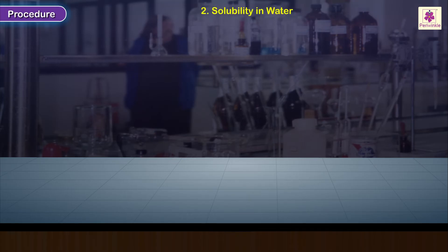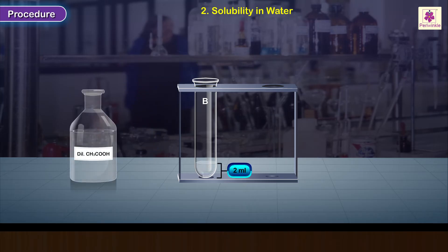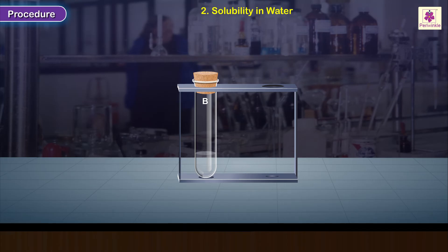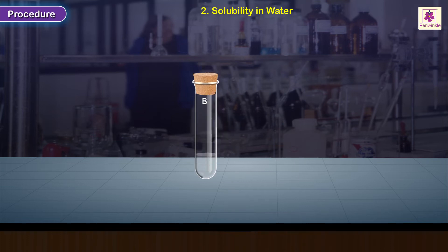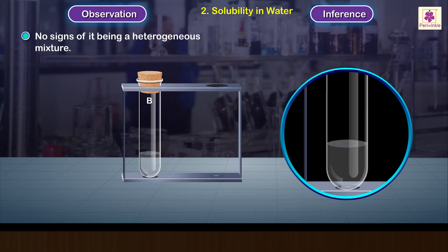Procedure 2 – Solubility in water: Take another clean test tube and label it B. Take about 2 ml of ethanoic acid in it, then add 3 ml of distilled water. Observe whether two separate layers form. Close the mouth with a rubber stopper and agitate the contents to mix them well, then observe. Observation and inference: the mixture is homogeneous, showing no heterogeneous nature.